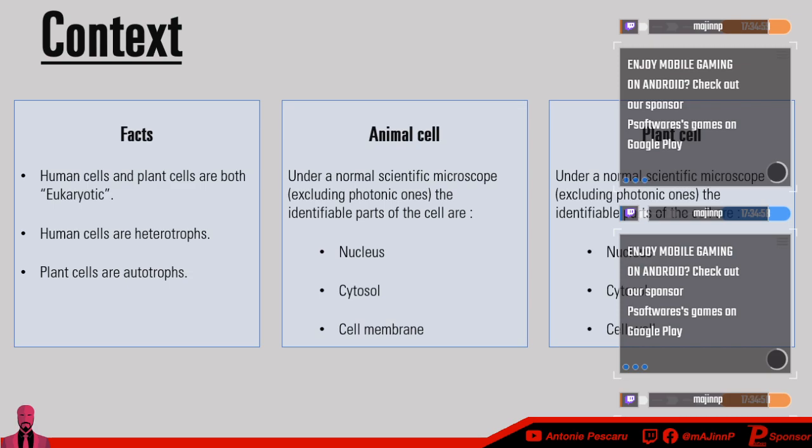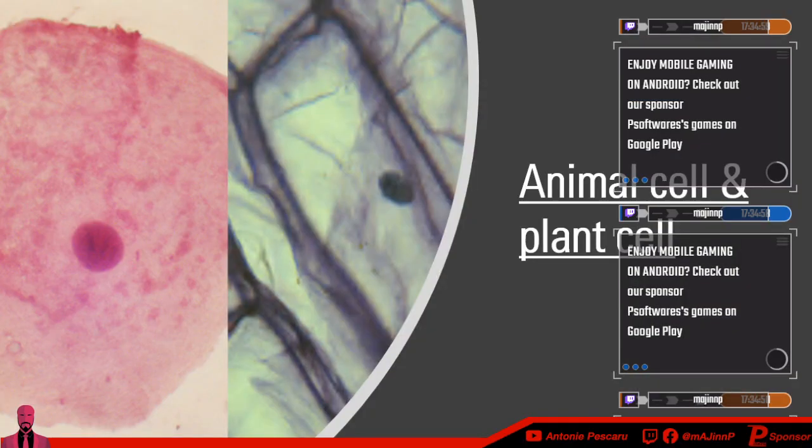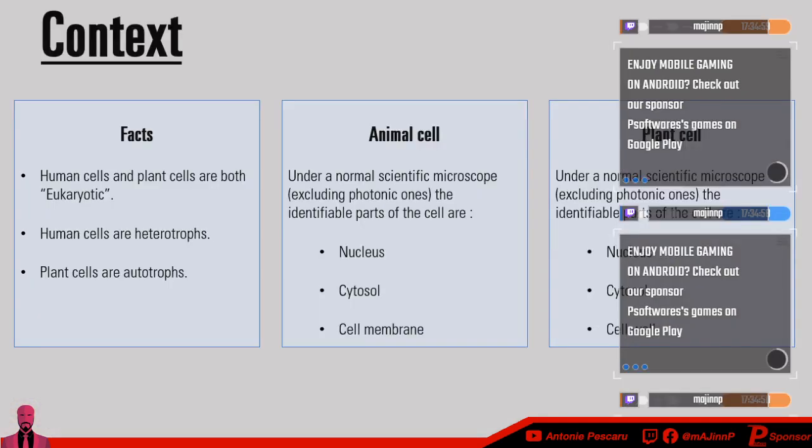And we're going to see why, because these cells have a real nucleus, as you saw in the previous image. If I can hover my mouse over here, this is a human epithelial cell, which we're going to be looking at, which, as you can see, has a nucleus over here. It's not a stain; it's a nucleus. And as you can see, there's a nucleus over here inside of the plant cell. So that's a little bit amazing in terms of similarities.